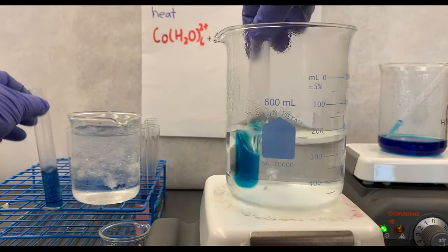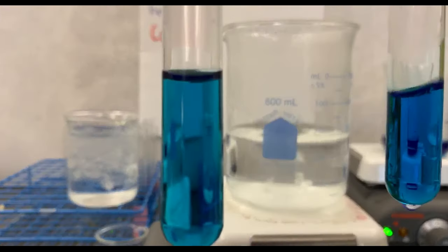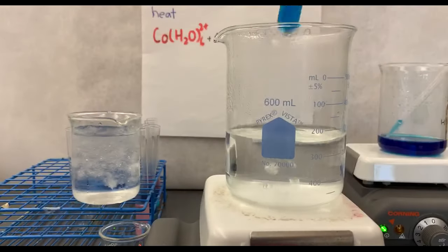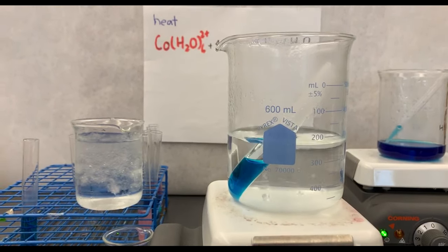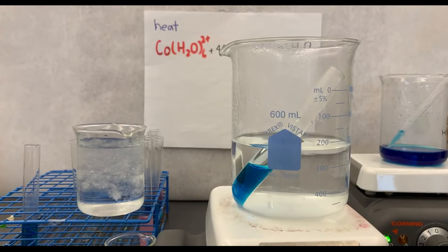Let me give you a comparison. This is what we started with. This is the color it is now. It is much more blue than it was before. The reason that it turns blue is, again, let's consider our reaction here, which now is being driven by the boiling water.